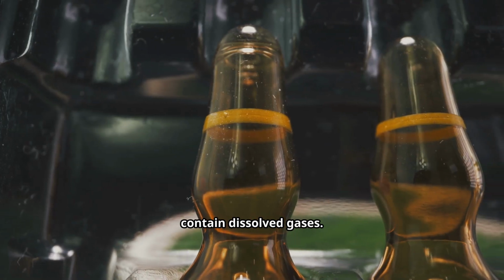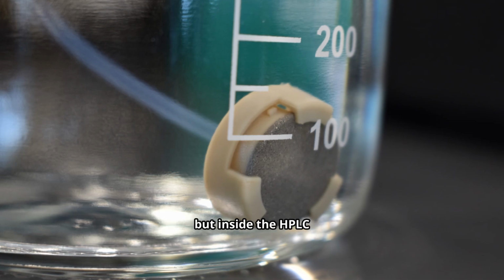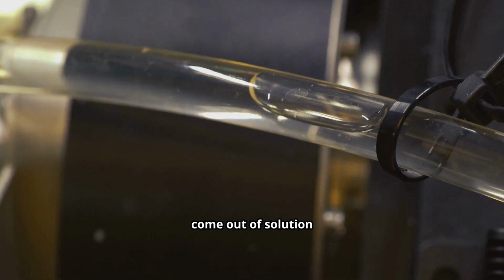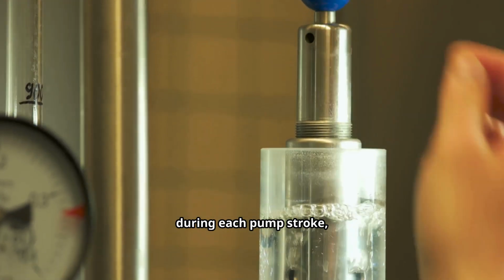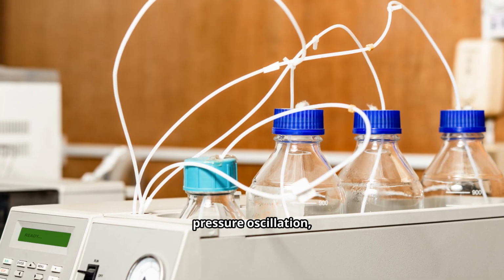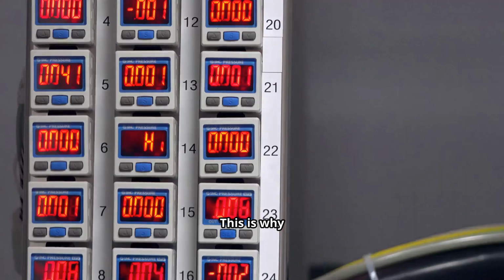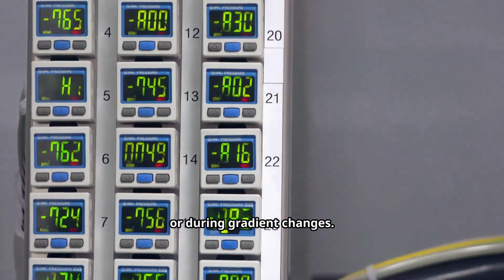All mobile phases contain dissolved gases. Under normal conditions, these gases remain invisible, but inside the HPLC pump and mixing system, the pressure drops rapidly. When this happens, dissolved gases come out of solution and form bubbles. These bubbles compress and expand during each pump stroke, which disrupts the delivered flow volume. The result is pressure oscillation, flow pulsation, baseline noise, and poor retention time reproducibility. This is why pressure instability often becomes worse at higher flow rates or during gradient changes.